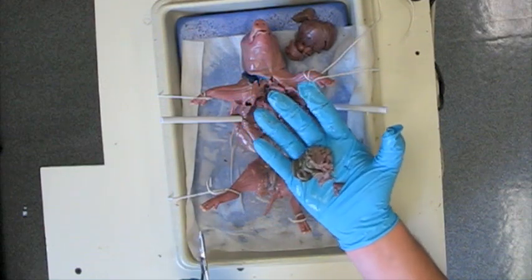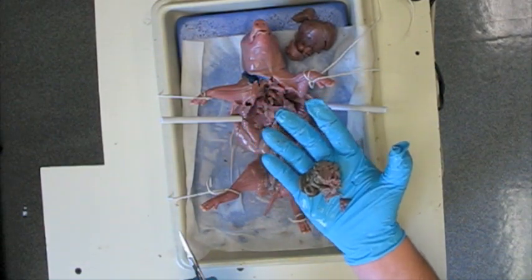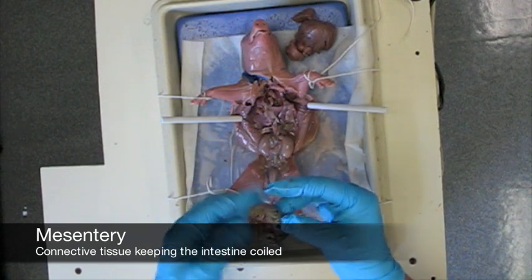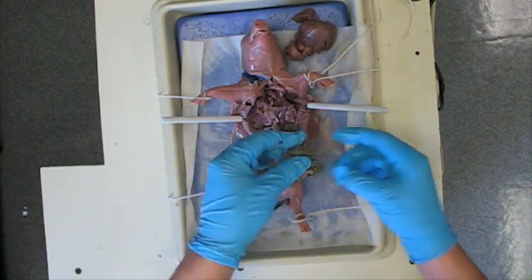Another good organ to look at is the small intestine. Notice the connective tissue called mesentery, which keeps the organ coiled. When totally uncoiled, the small intestine can reach 150 cm.